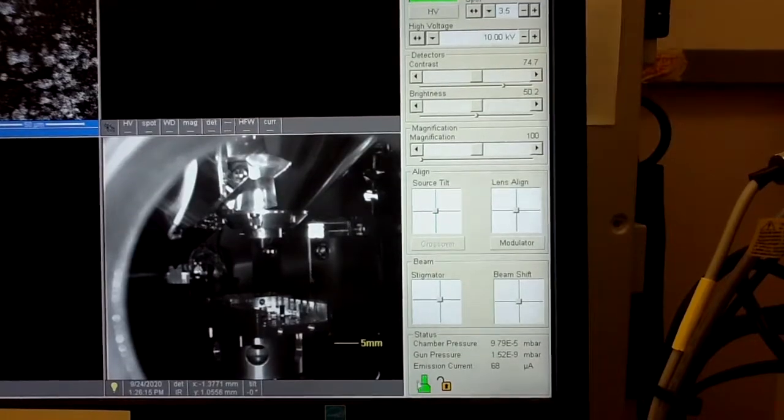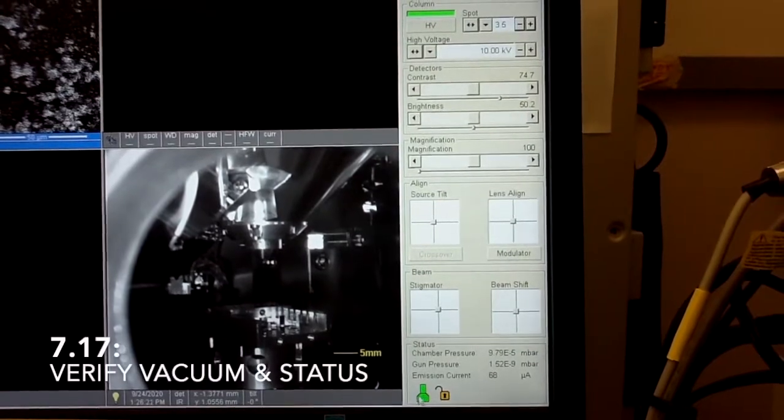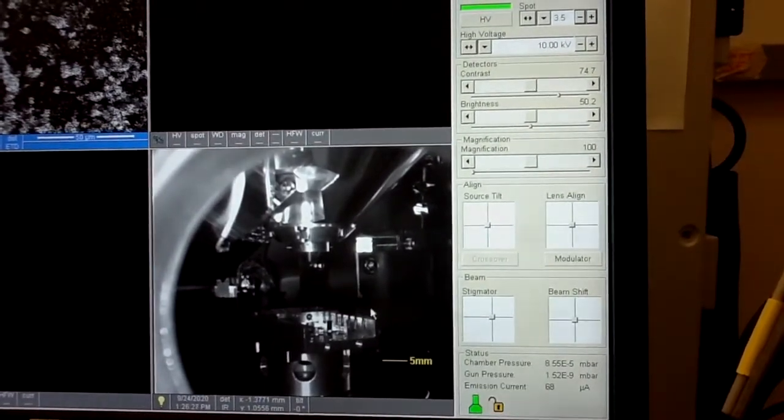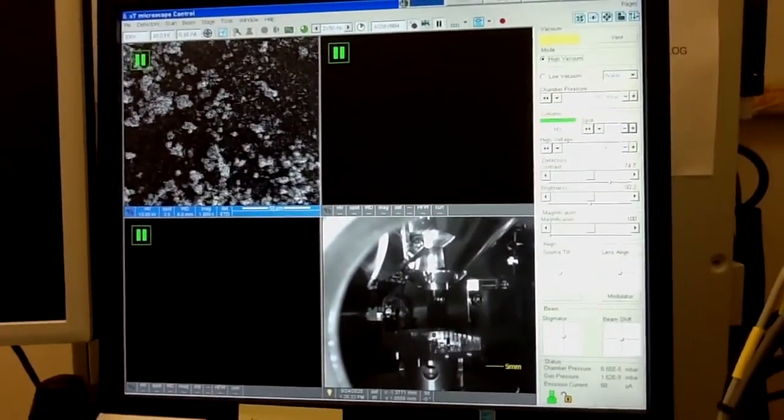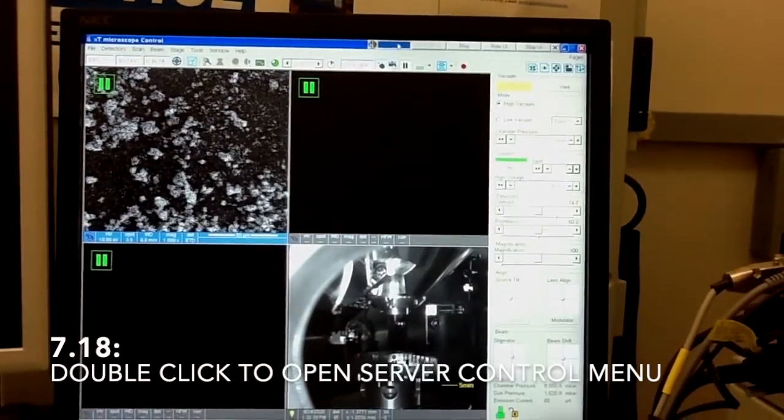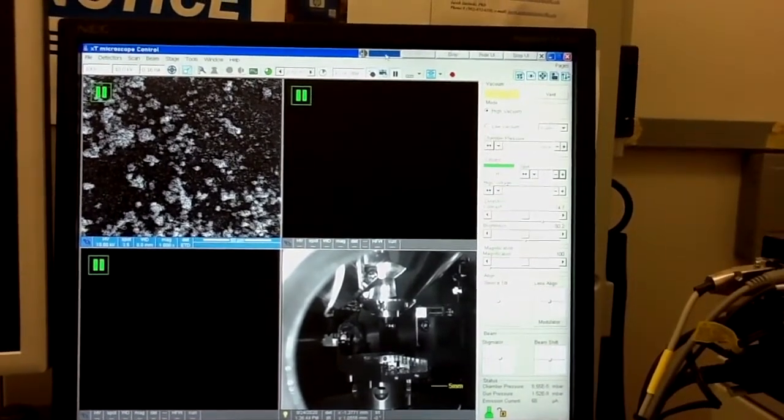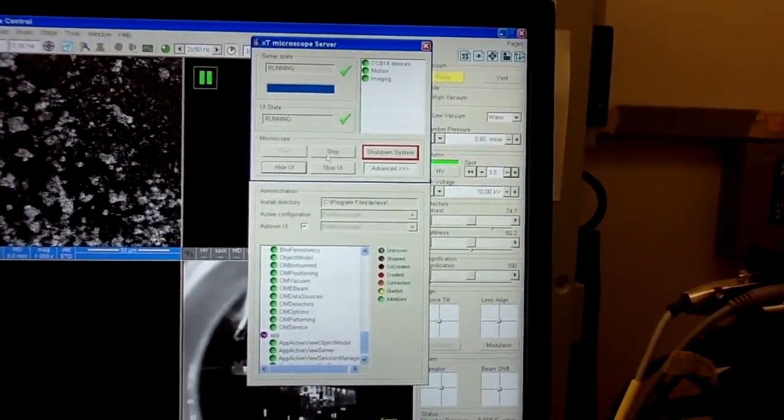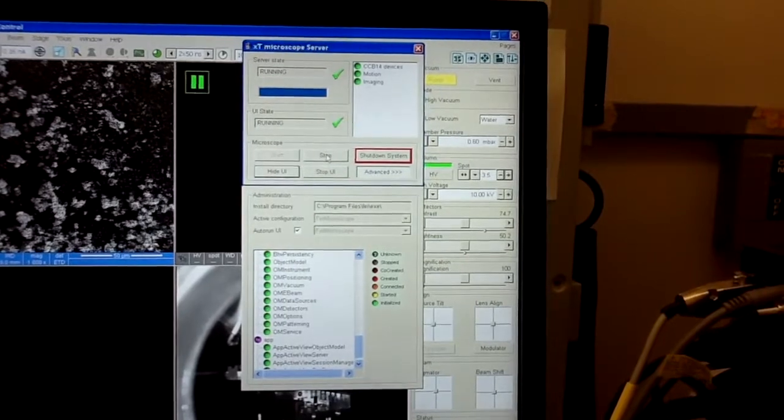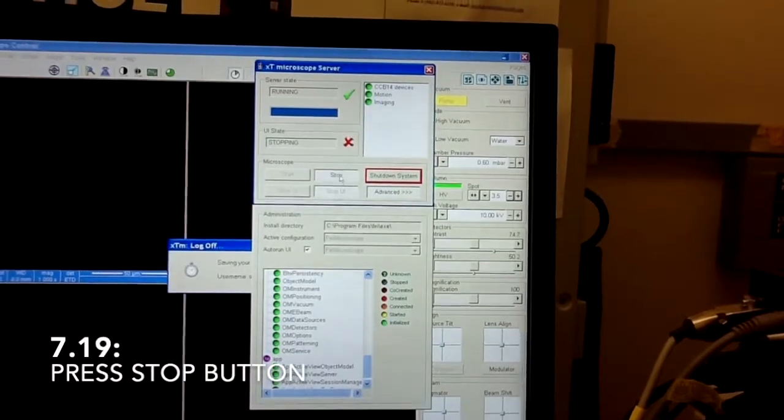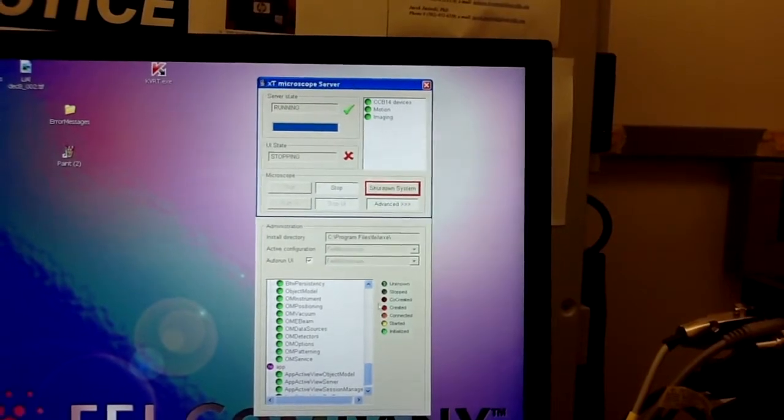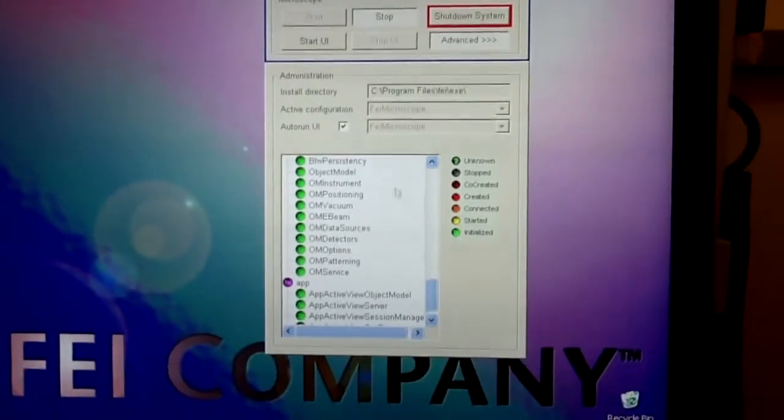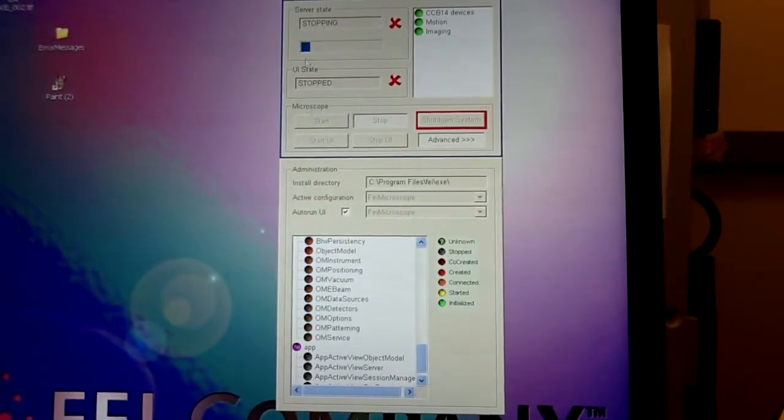So wait until your pressure is in high 10 to the minus fifth and especially until you see this icon turning green again. This means that the system is under good vacuum and this is a moment where you can end your work. For this double click now here to maximize the view of this server controller. This is a window which will open so you have to stop the server. So before at the beginning we started the server, now we will stop it. Just click stop button and wait for this dots to change to stopped which is gray color. The server is still running but it's stopping right now.